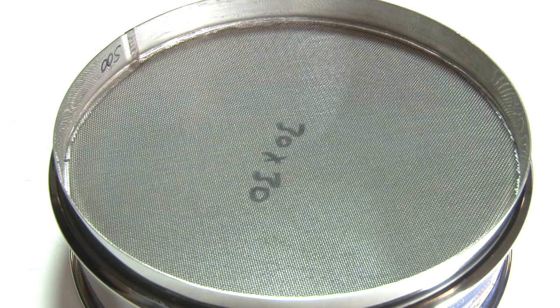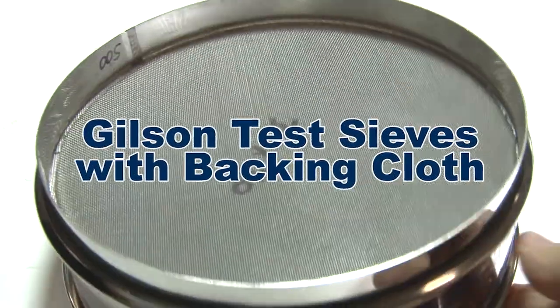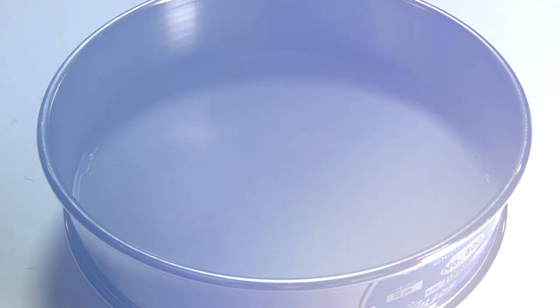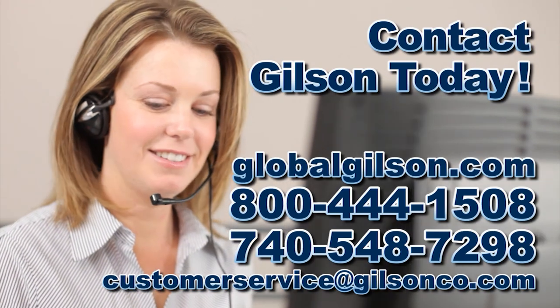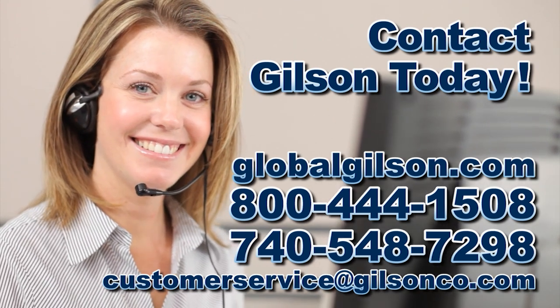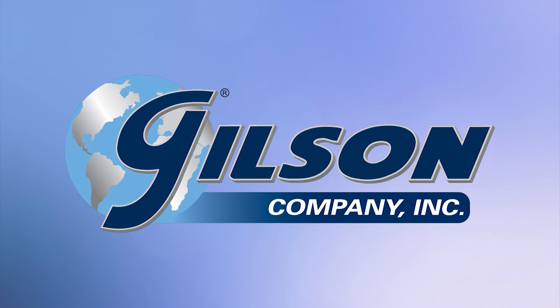So when you want strength in your testing cloth to reduce mesh distortions, consider Gilson test sieves with a backing cloth. Be sure to check out these and all our products listed in the Gilson catalog and on the Gilson website. Gilson — your industry leader for materials testing equipment.